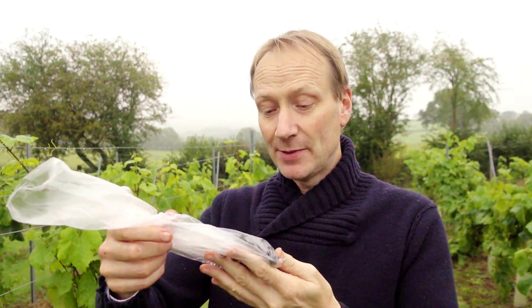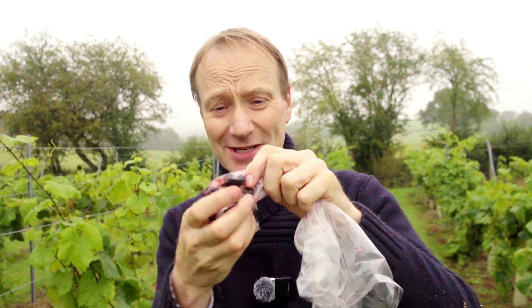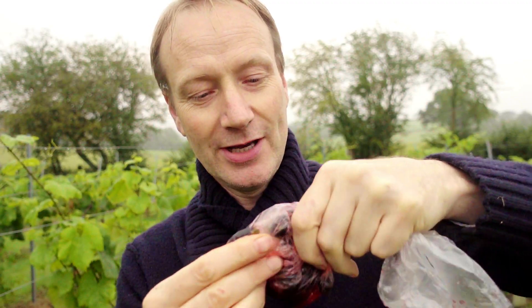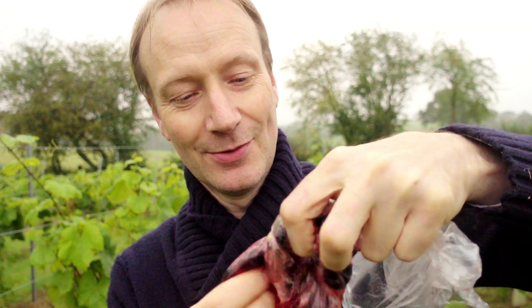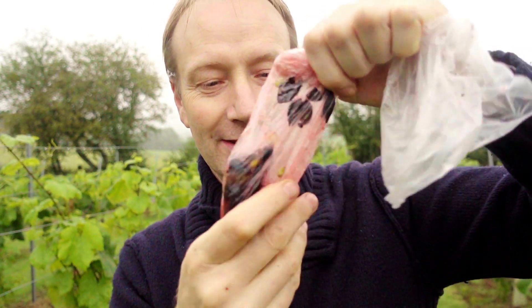We've got probably about 50, 60, 70 grapes in the bag. I haven't just chosen the big juicy ones — I've chosen little ones and big ones, basically closed my eyes and picked a few off each bunch. What we do now is just squish it so that we mix all the juice together. I'm going to get every single grape in there all nicely squished — it's coming out as a lovely red color. I think that's pretty well squished, with all the juice nicely mixed up.